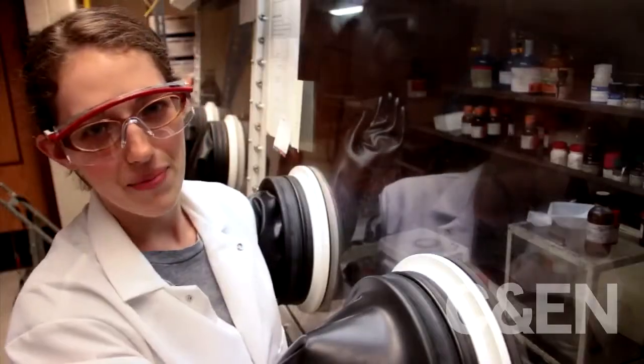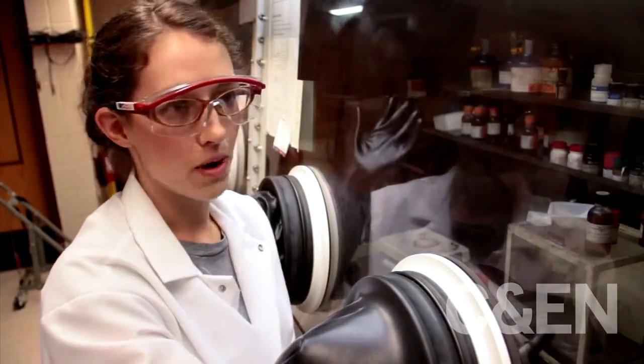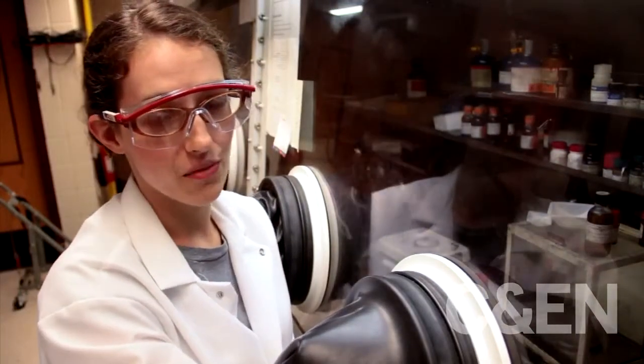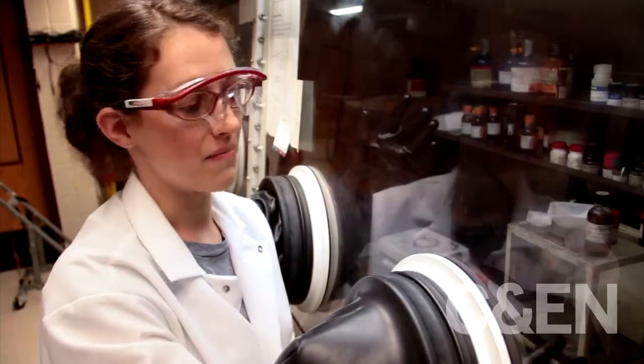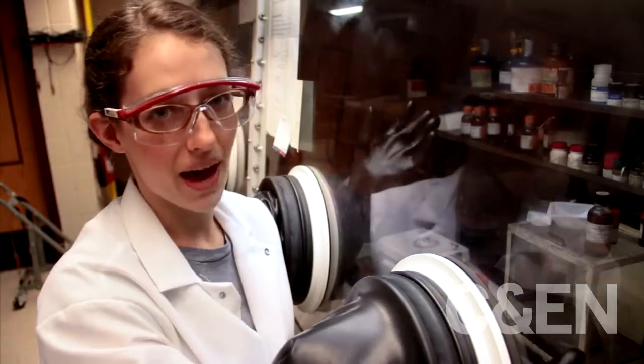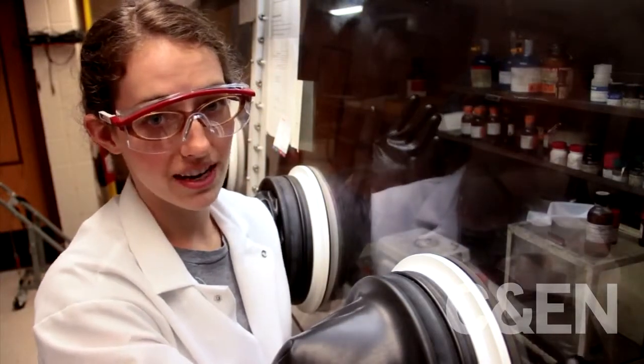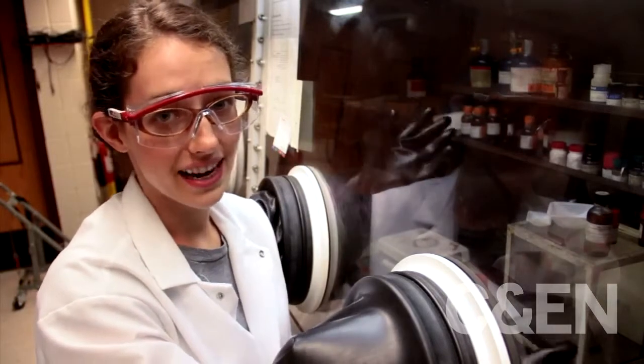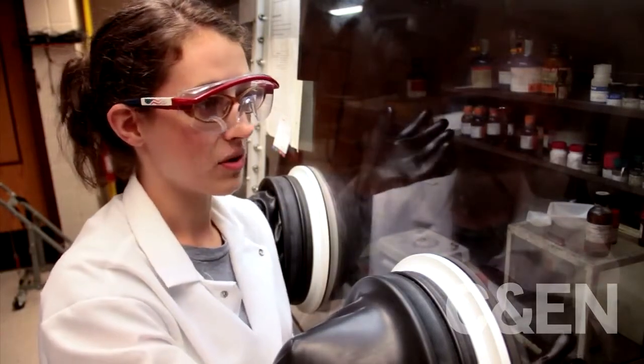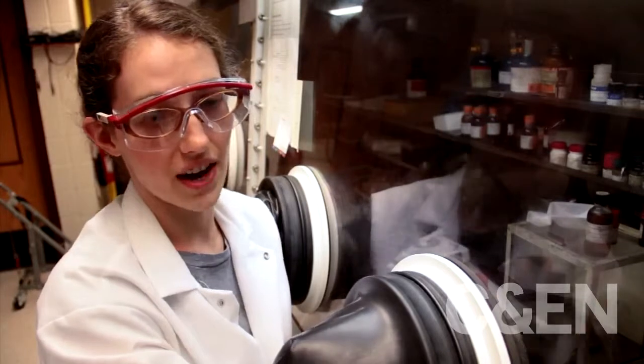So this is a glove box. It's filled with argon and it serves two purposes. The first is to protect us from the chemicals. Some of them give off bad odors that could be harmful to the body, so we keep them in the glove box. And the second is to prevent the chemicals from degrading in the presence of air.